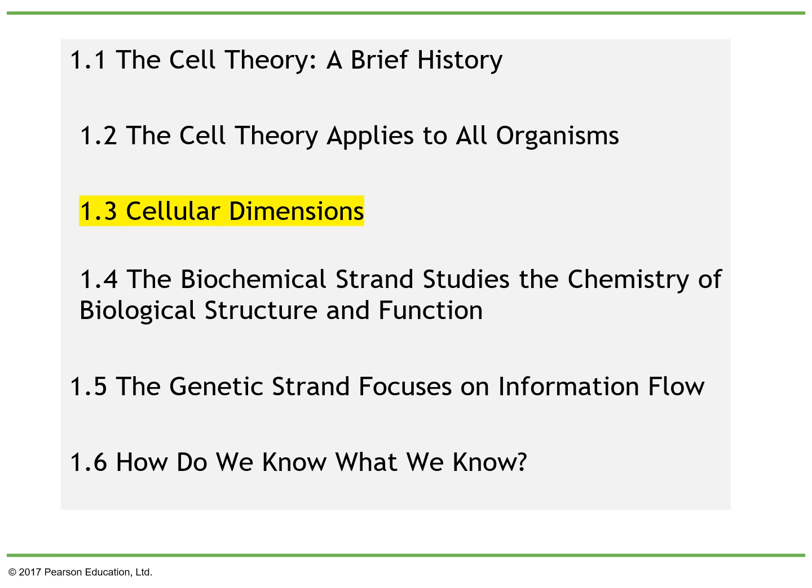In the first section, we talk about the brief history of cell biology, and then we move into the development of the cell theory. Then we talk about the different cellular dimensions, sizes, and shapes of cells. Now we're going to talk about how we're able to observe these different sizes and shapes, and we're going to focus on microscopy.